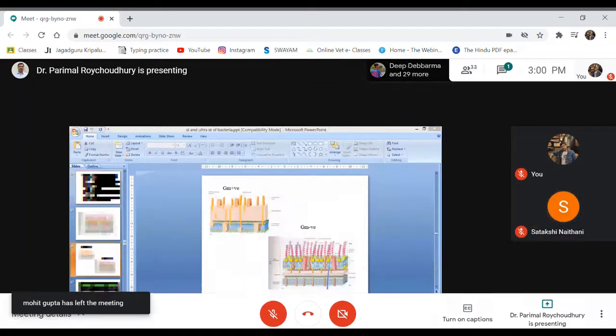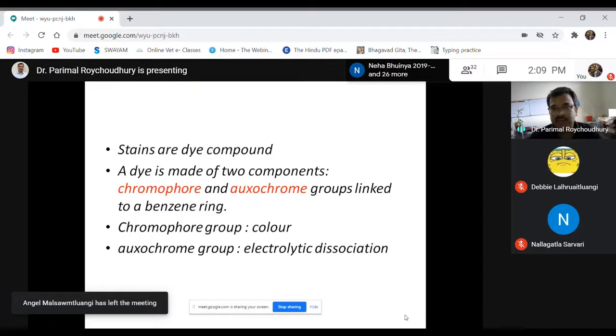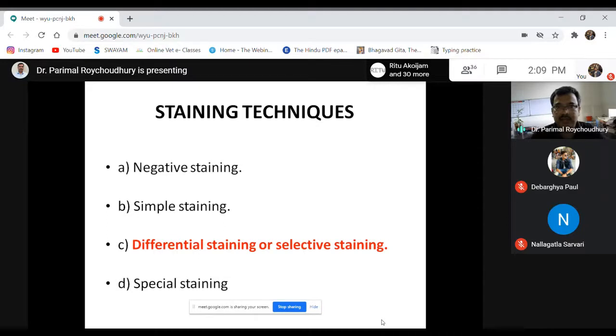Thank you, sir. Okay. So in a white background, you can see some colored organisms. Their shape, size, and arrangement can be identified. That is the basic principle of putting color to the bacteria, staining for bacteria. At the same time, with the development and improvement of staining techniques, now we have differential staining that we discussed in our last class about the different types of staining.